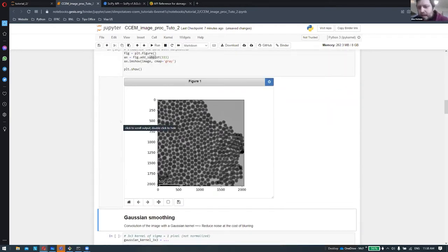Okay, so just for the sake of the example, here we have our nanoparticles. If you can see my mouse, you can navigate through the data, and you should see on the bottom right the coordinates x, y and the intensity value that is there. So here something like 144, here 96.